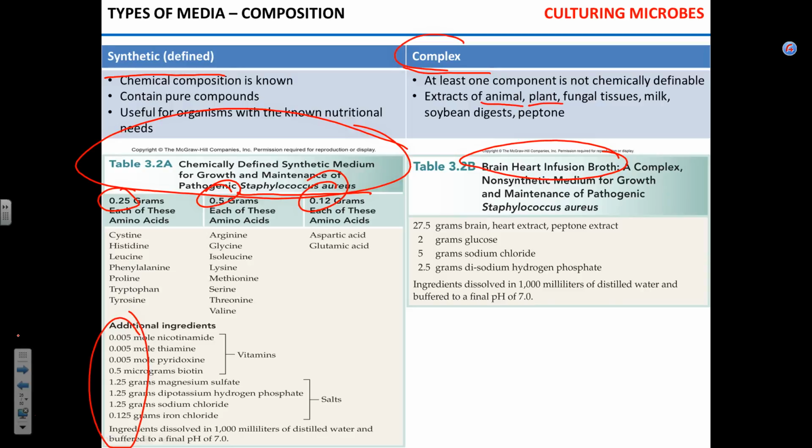The source of nutrients can be animal extracts, plant. So TSA stands for trypticase soy agar. So soy protein is being broken down. Peptone, yeast extract, whatever you can think of that contains all essential amino acids, all 21 amino acids, can support bacterial growth. The question that can arise easily, why don't we use complex all the time? Why bother with defined media?